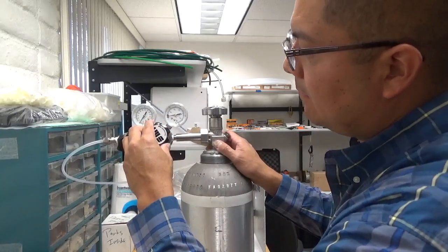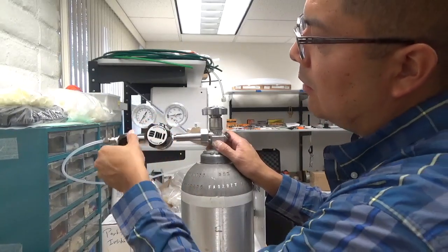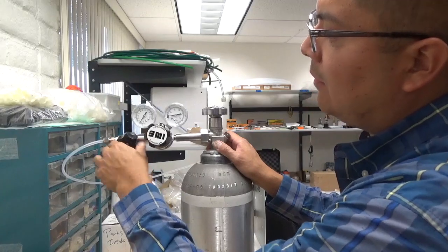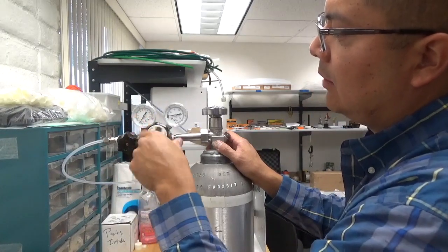So I want to close everything up now. We'll close the regulator output valve off and then the cylinder valve, the regulator valve.